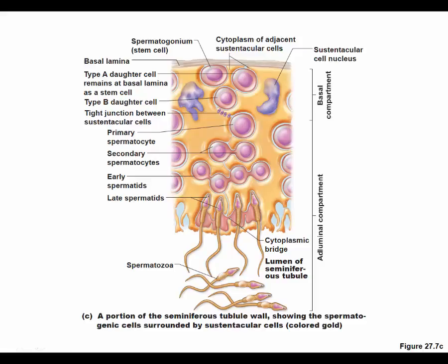So you write the letter N there; you can label that in there. These are all N, and their names are early spermatids. These are also N, only 2 of them, secondary spermatocytes. This is 2N, 46 chromosomes, primary spermatocyte. And out here on the very edge, spermatogonium, also 2N.